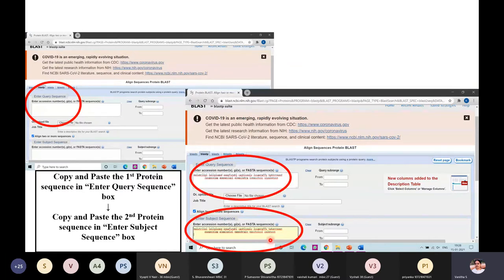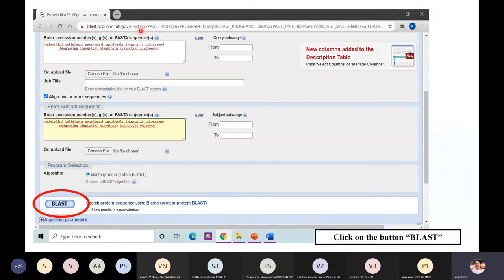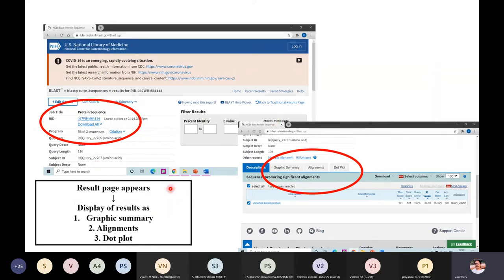Copy the insulin Sus scrofa amino acid sequence from your Word document and paste it into the subject sequence box. The first box is the query sequence and the second is the subject sequence. Once both sequences are entered, click the word 'BLAST' at the bottom. Wait a few seconds and the results will be displayed.